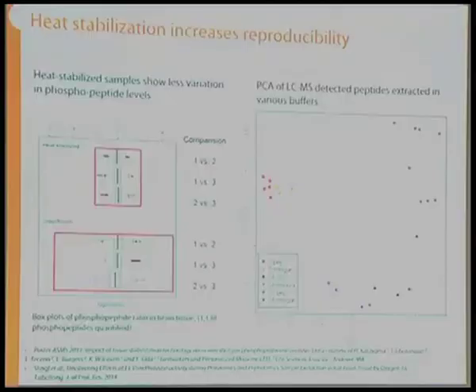These are various extractions of peptides using different extraction buffers, all urea-based, and after that there are various incubations at generally 37 degrees.